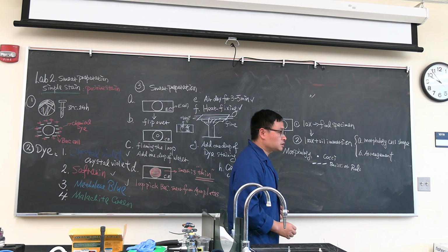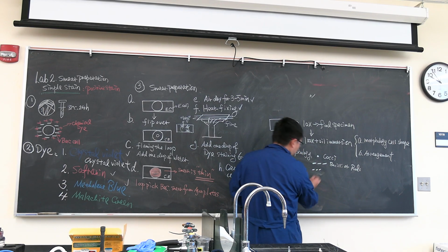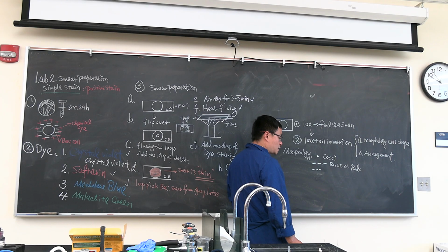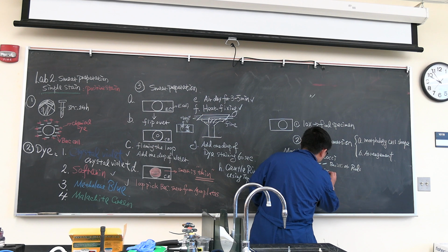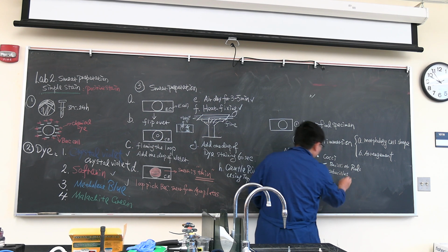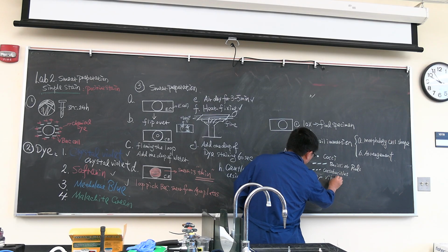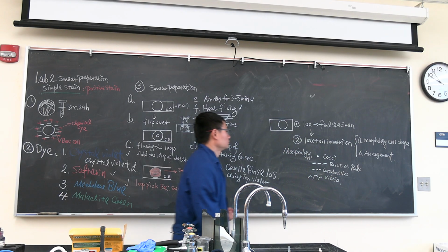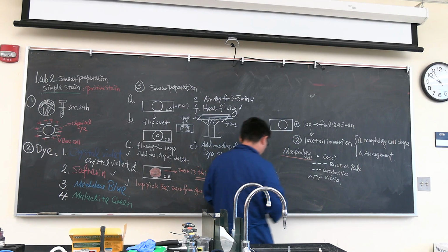Later on, when we learn the pathogens, lots of them look like a coccus but like a rod, so we say coccobacillus. And you will also see something like this, that's called a vibrio. That's morphology.